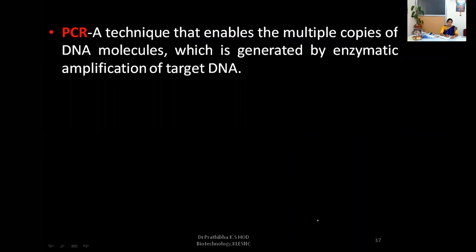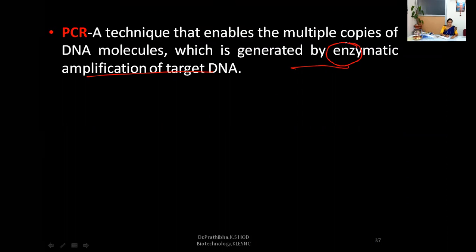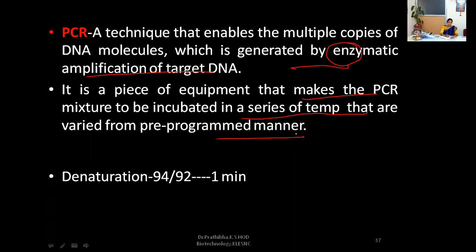Okay. Let me conclude here with the definition of PCR and with the applications. What is PCR? They ask me. PCR is a technique that enables multiple copies of a DNA molecule, generated by enzymatic amplification of target DNA. This PCR amplification is possible only because of enzymes. So we can mention this as the enzymatic amplification of target DNA. It is a piece of equipment that makes the PCR mixture to be incubated in a series of temperatures that are varied in a pre-programmed manner. We can give this particular definition also.